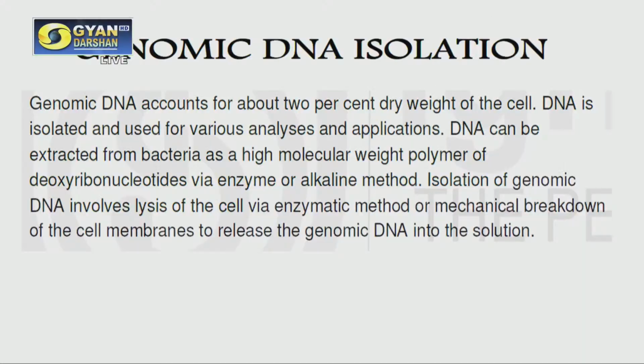So now take a look at what are the topics for these experiments. We will come one by one. The first experiment that you have is the genomic DNA isolation. Now first of all we should know what is meant by the genomic DNA and why do you need to isolate genomic DNA?